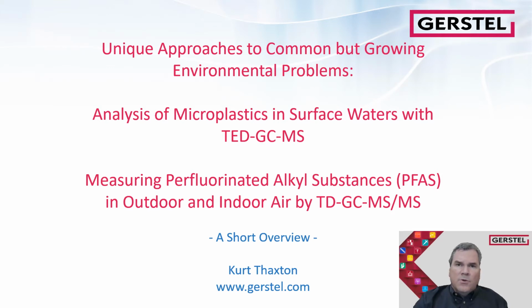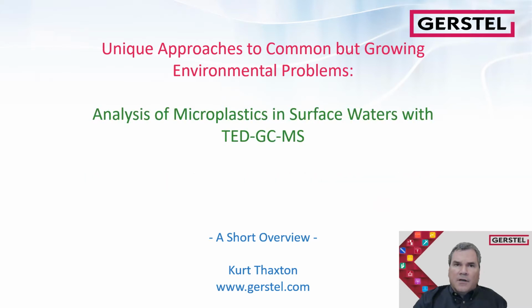We'll cover two new selective, sensitive, and effective techniques for dealing with two of the most troubling problems we all face today in the environmental world: the analysis of microplastics in surface waters with TED GCMS, and measuring perfluorinated alkyl substances in outdoor and indoor air using thermal desorption GCMS. So we'll get right to it. First, we'll talk about the analysis of microplastics.